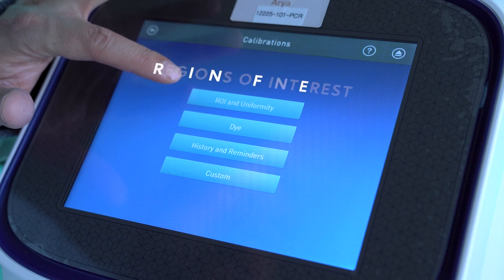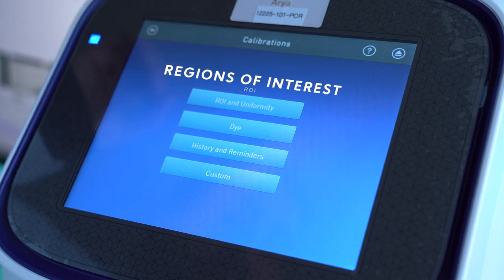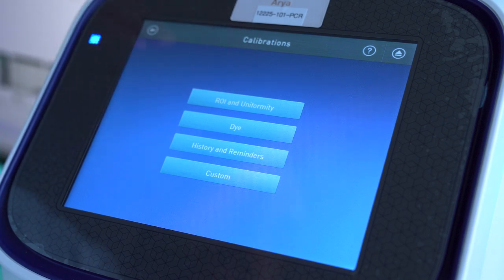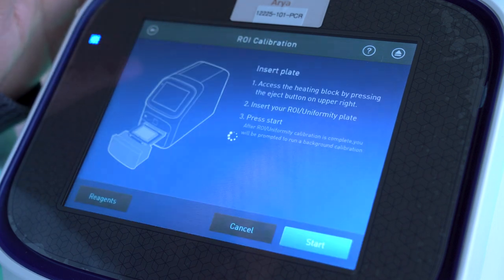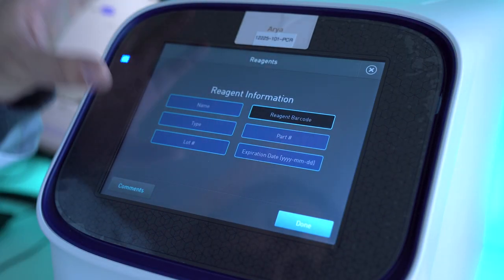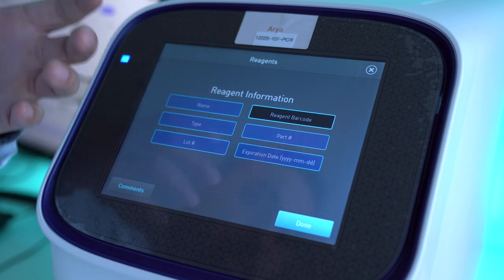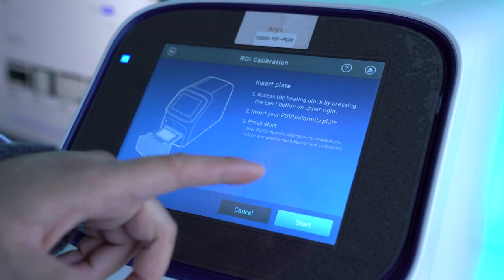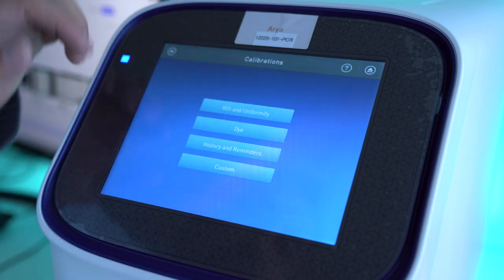ROI stands for Regions of Interest and Uniformity — that's making sure the camera is on the well. There's a plate you can buy for that. If you click here and click Reagents, you can input the specific lot numbers and part numbers of the part you bought. Then once you're ready, you can hit Start and begin that process.